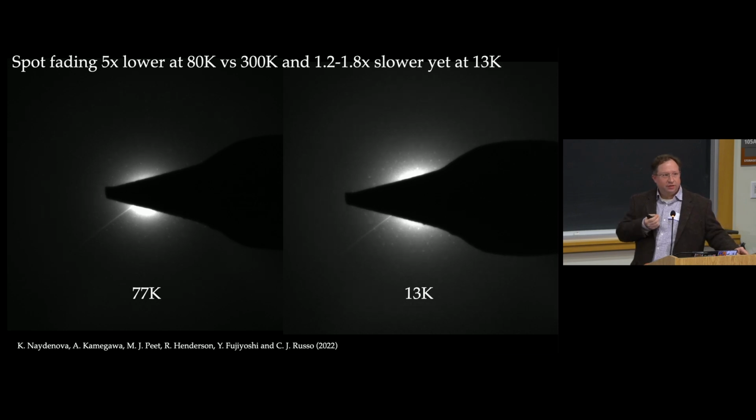because a 300 kilovolt electron or even a 100 kilovolt electron can easily break any bond in any molecule. I mean, these are vast amounts of energy compared to the energies that are holding atoms together. So that's not the thing that's happening here. The thing that's happening is that we're stopping the breakdown products from moving away from where they were to start with and causing even more damage.